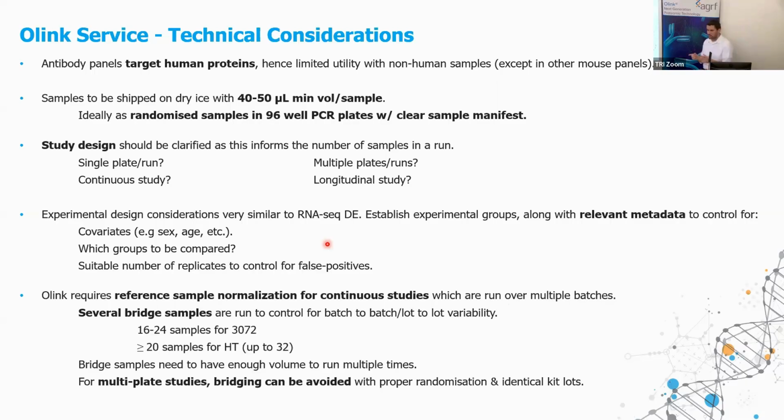Finally, there's a requirement for bridge samples across continuous studies. We can go through this further if you do have a study plan in mind, but this is to say if you're running kits, if you're running samples across multiple kit batch lots, there is the necessity for bridging.